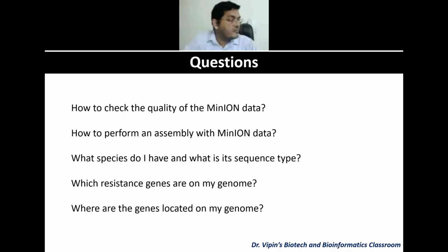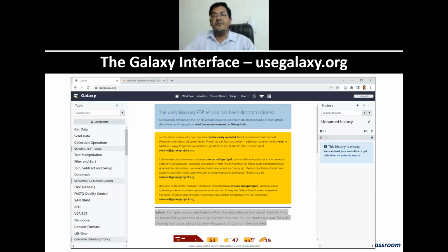Today, of course, we'll start. We still have some 14 minutes left, so we can start today. I will give you a basic introduction and you can upload your data today. And tomorrow we continue with the analysis, right? So here you are. If you go to usegalaxy.org, you can create your account. Even if you have not created your account, you can just have a look as of now. This is the interface that you have at Galaxy here.